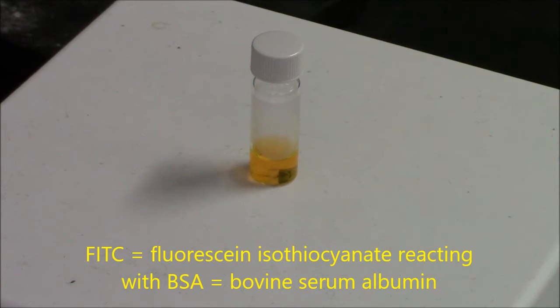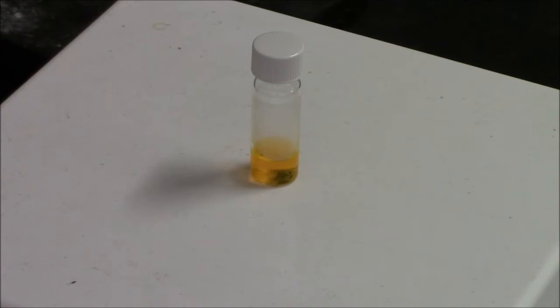Here's a typical labeling reaction, Fluorescein Isothiocyanate, FITC, reacting with BSA, Bovine Serum Albumin.